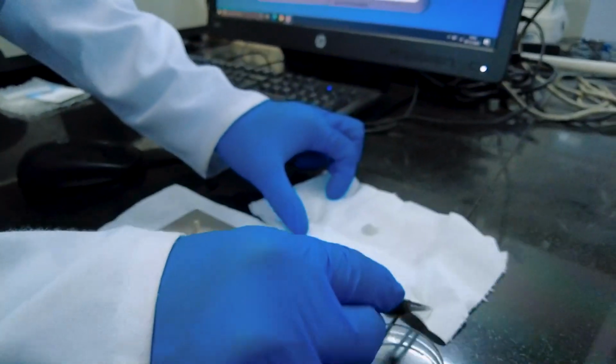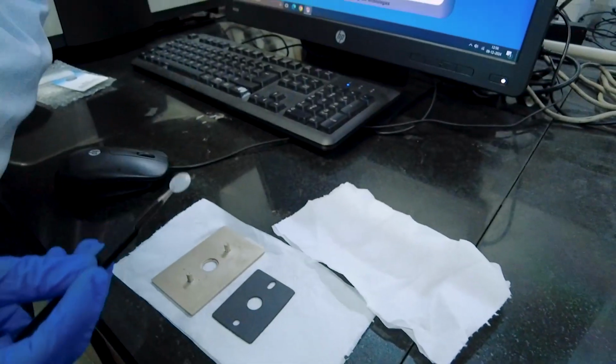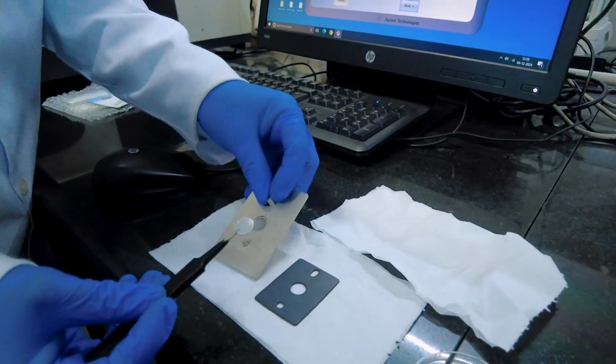After it has collected the background, keep the pellet in the pellet holder carefully without breaking it, as shown in this video.